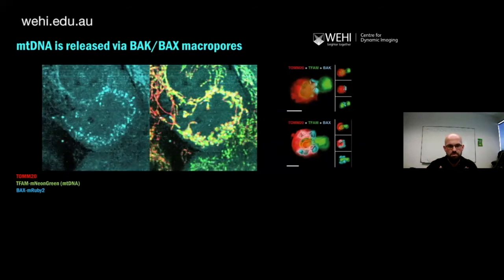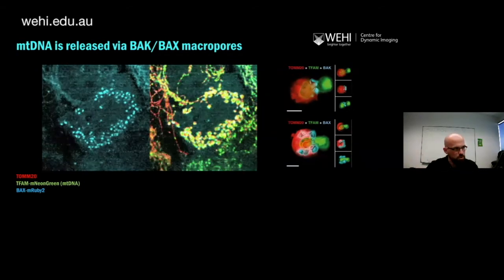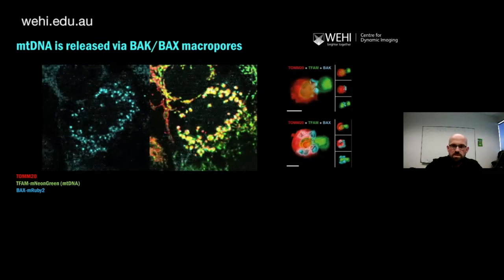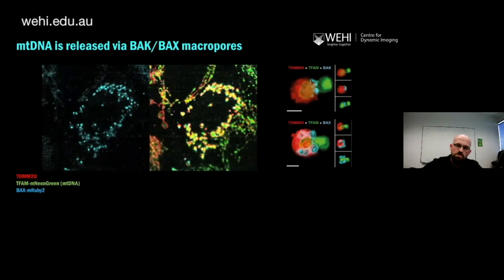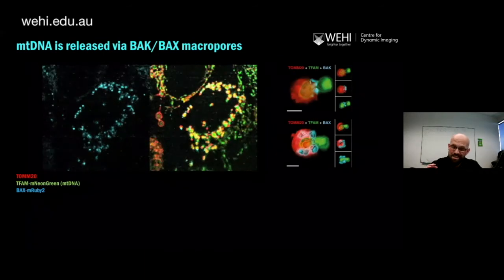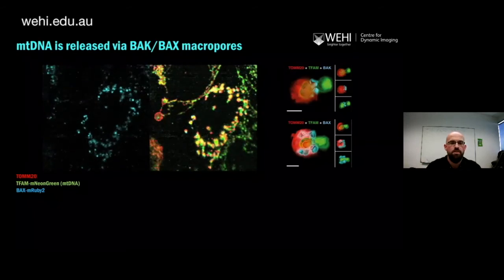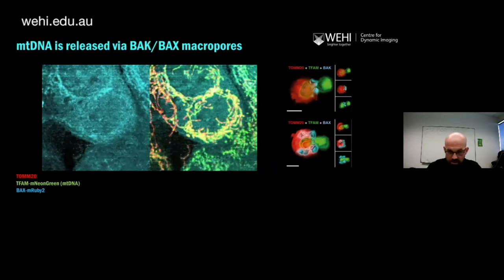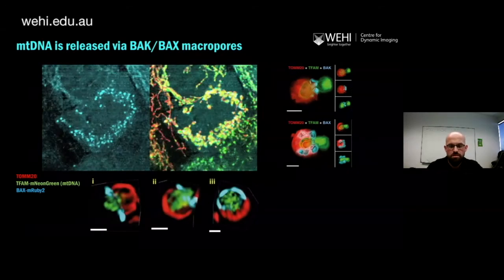Because lattice gives you this beautifully broad overview of a complex process, it is limited in resolution, but what you can do is figure out from the lattice exactly the specific point where you think the interesting biology is happening, and then move to fixed imaging and look at it using super resolution microscopy.